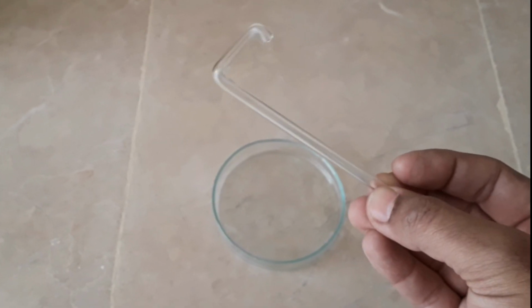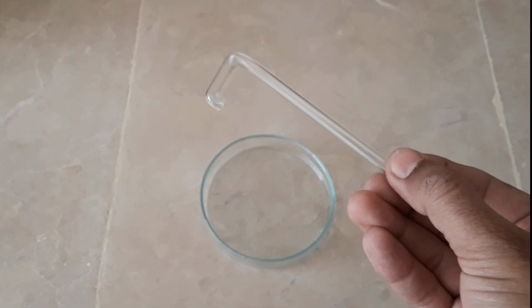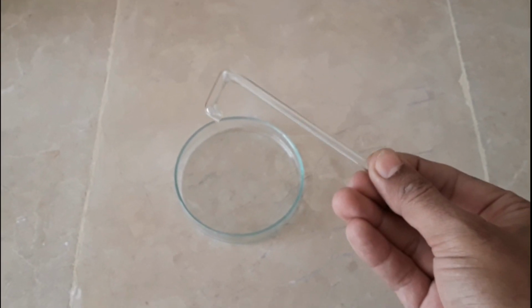Step 3. Allow the glass to cool and solidify. Once it reaches room temperature, you'll have in your hands a one-of-a-kind, custom-made L-shaped cell spreader, ready to revolutionize your lab work. Advantages. Now, let's talk about why this DIY approach is worth it.